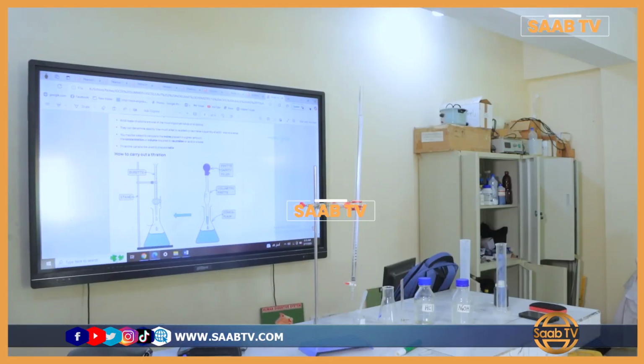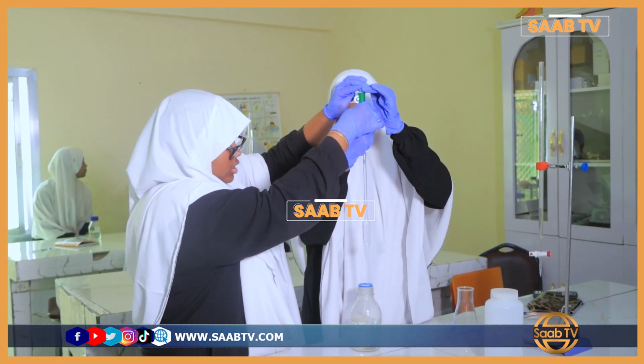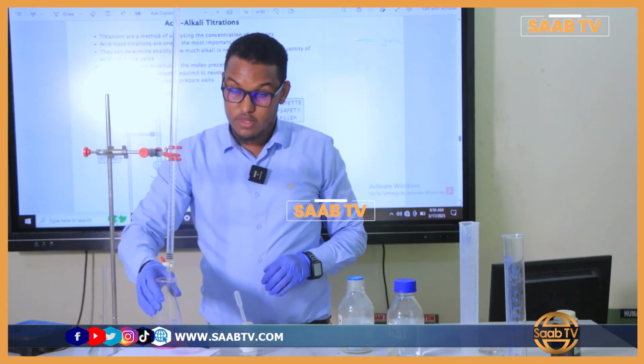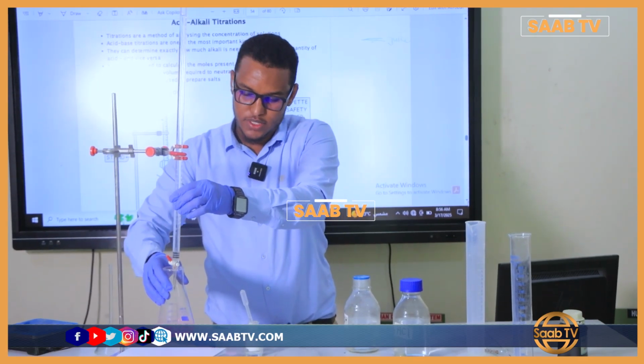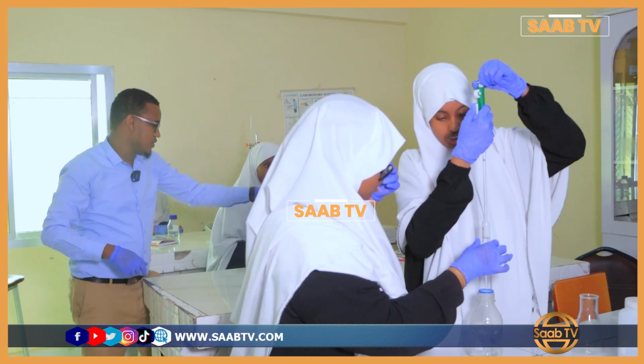You see, guys? Look at this one, how the color will turn.